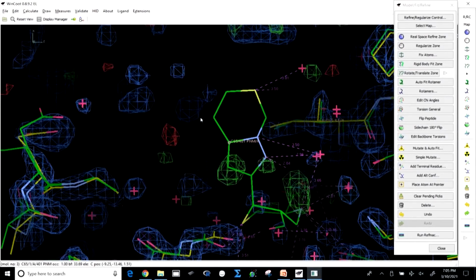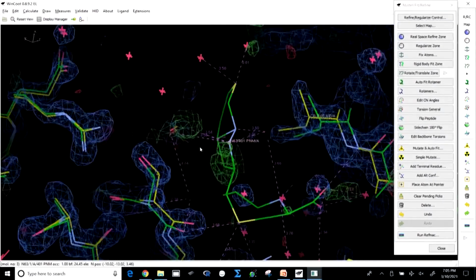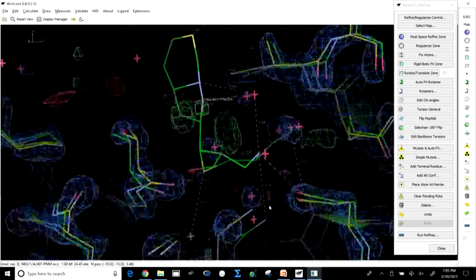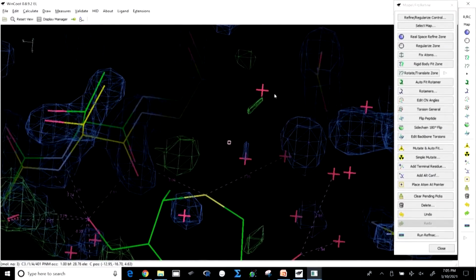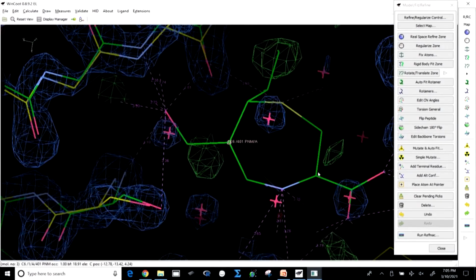This is the penem. Here you see a 7-membered ring. Now, how does it interact with the protein? You see that. So, now you see the 7-membered ring, 1, 2, 3, 4, 5, 6, 7.